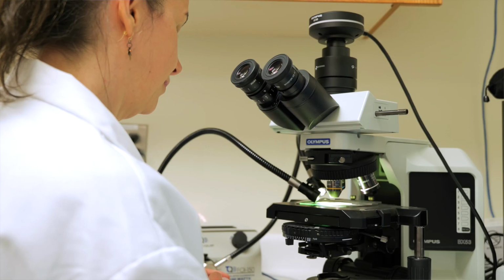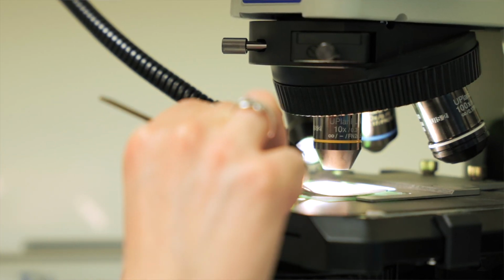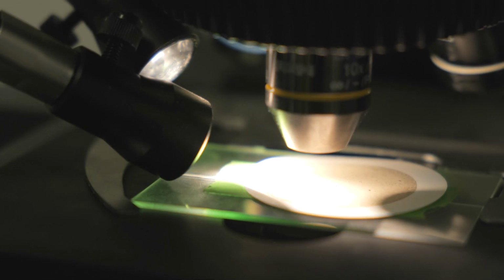We used an FTIR particle scanning technique to mass identify particles so that it could tell us what percentage is organic, what percentage is mineral, and what percentage is polymer. We found that anywhere between 2 and 6% of the particles were polymers, with an average of 4% plastic.